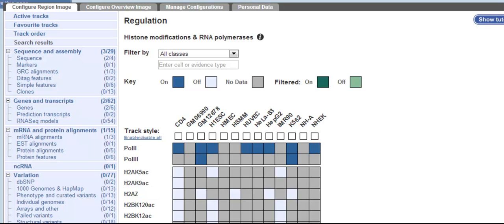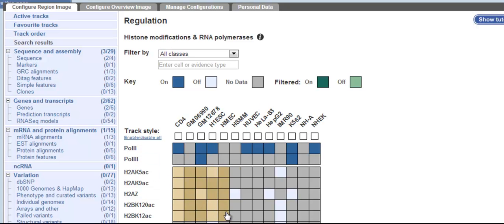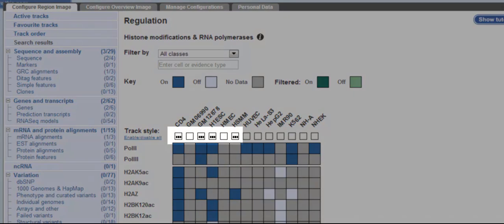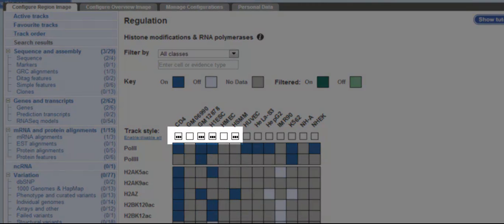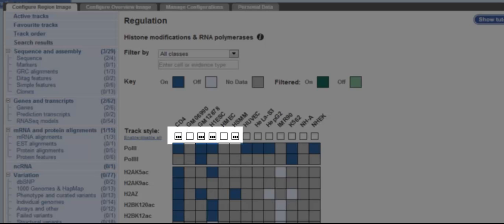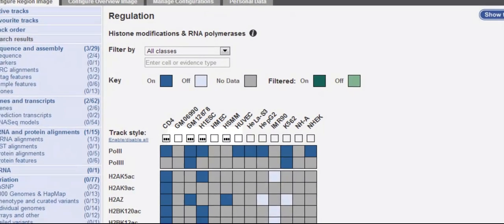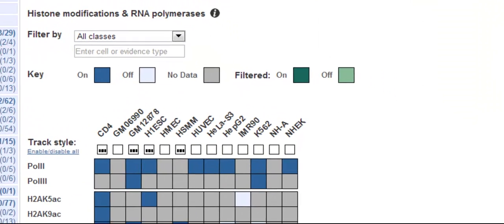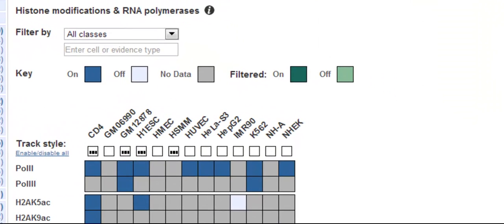I'm going to show you a couple more features. You can drag and select boxes on most updated browsers, but this won't work on Internet Explorer 8 or below. I'm using Chrome so it will work. This turns on a region of the matrix. Notice that if I do turn on some histone modifications, the corresponding cell type is automatically selected.